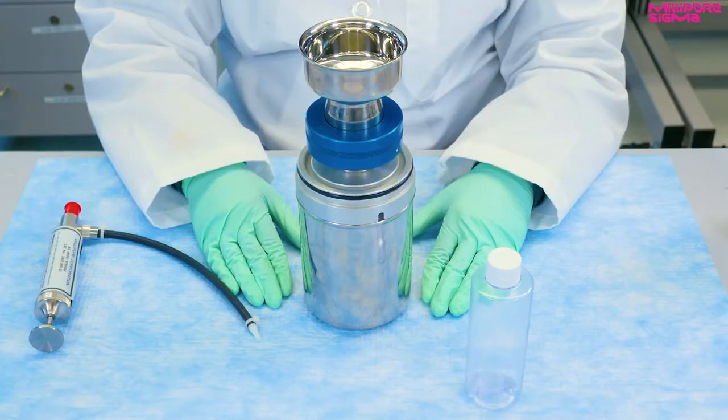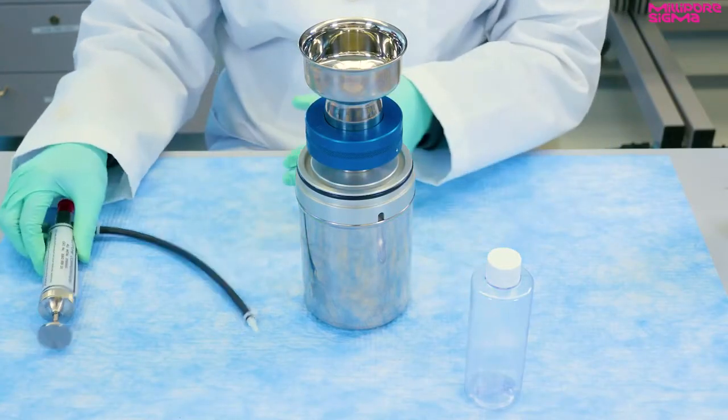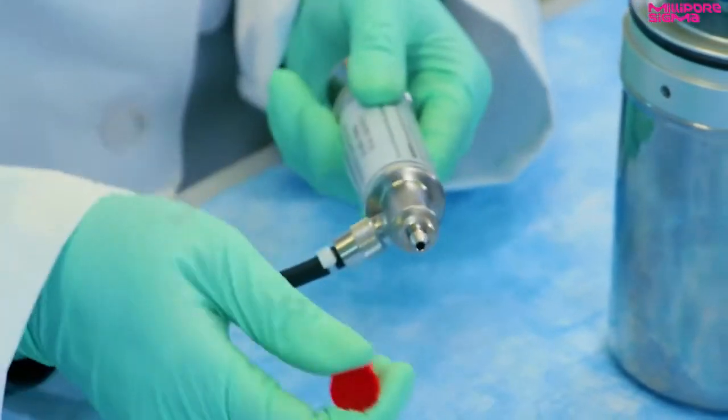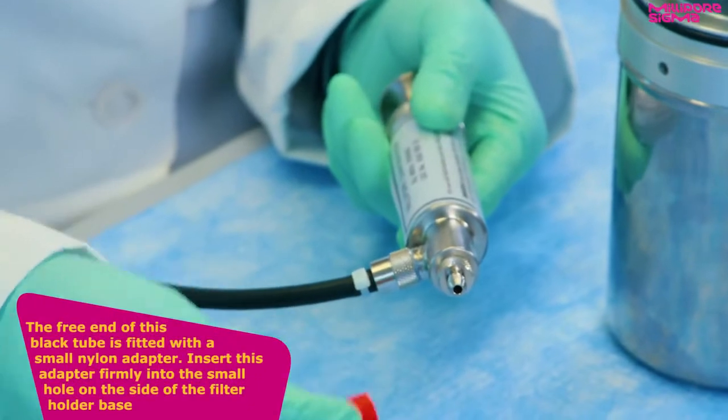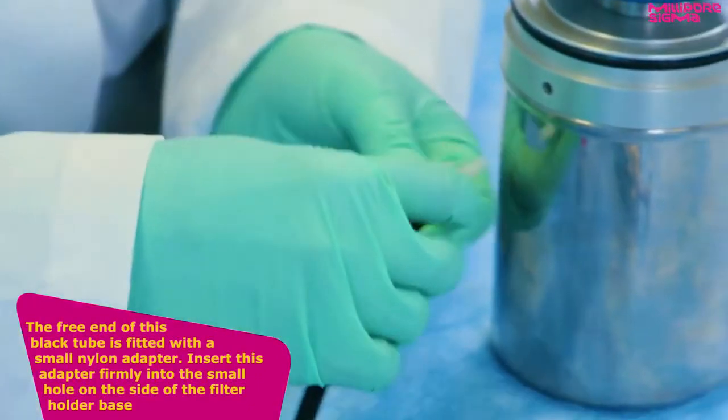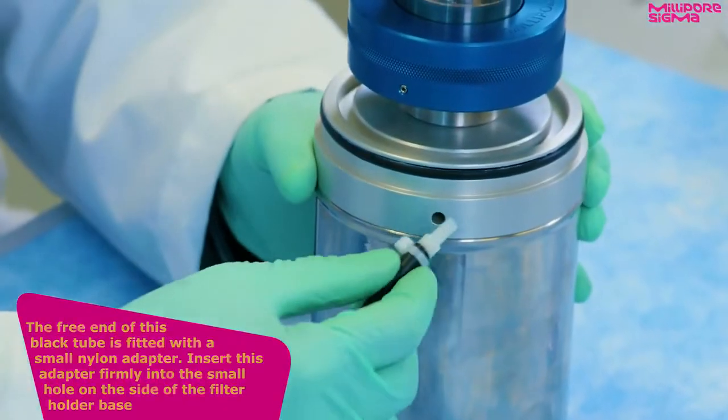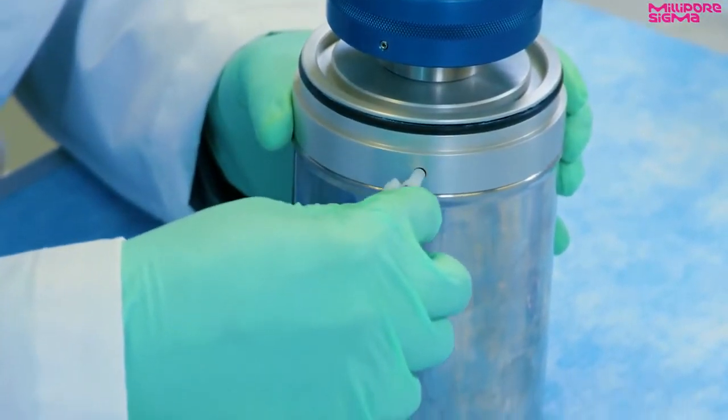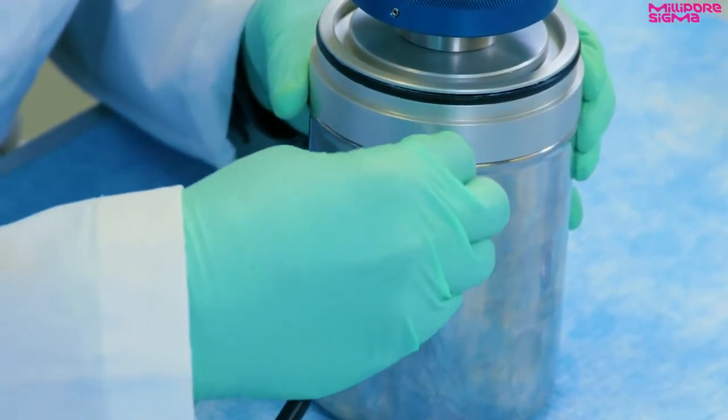Now let's prepare the filter holder for vacuum filtration by attaching the syringe vacuum pump. First, remove the red protective cap. The free end of this black tube is fitted with a small nylon adapter. Insert this adapter firmly into the small hole on the side of the filter holder base. The tube and adapter are normally left attached to the syringe for storage, but it can be removed for cleaning if needed.